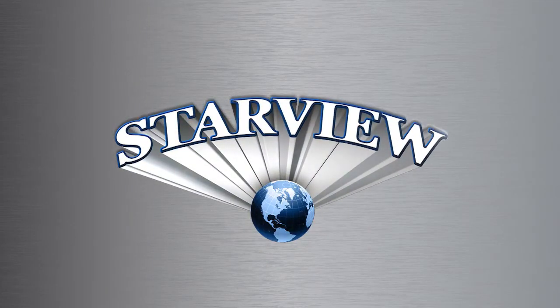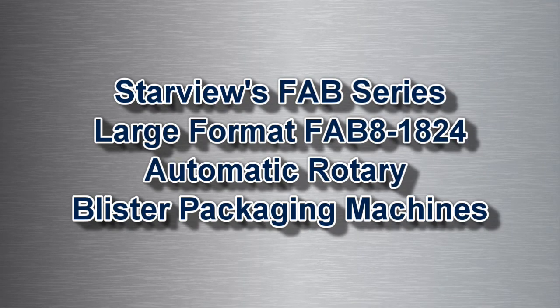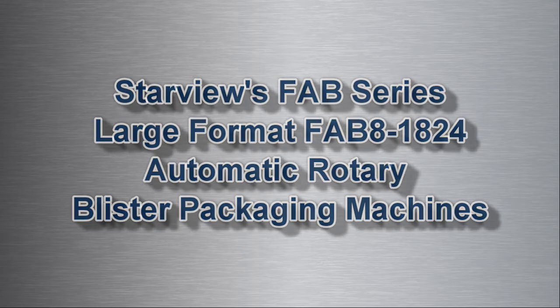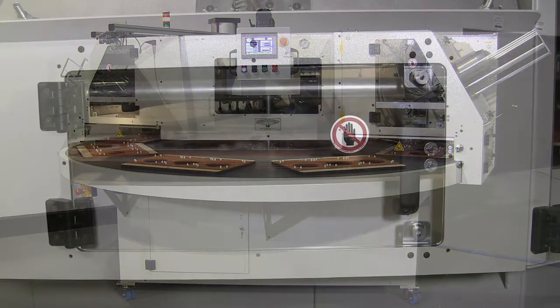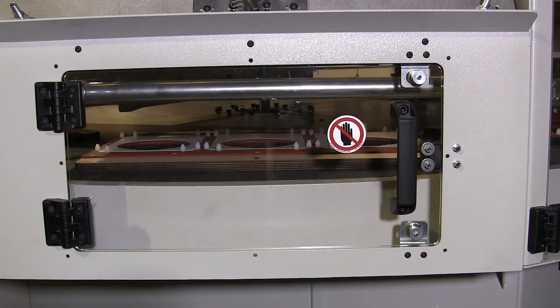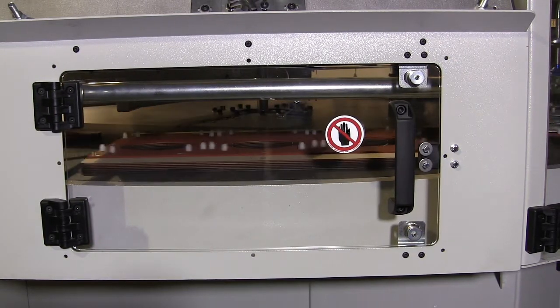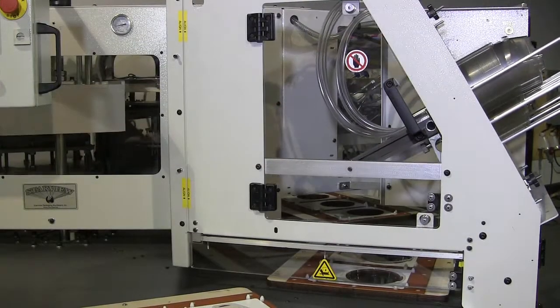Featured in this video is Starview's FAB8-3 series fully automated rotary blister sealing machine, designed and manufactured for the automated production of trapped blister packages. These machines can also run any standard face seal blister package configurations. Machines are available as 8 station with nominal sealing areas of 14 by 18 inches or 18 by 24 inches.